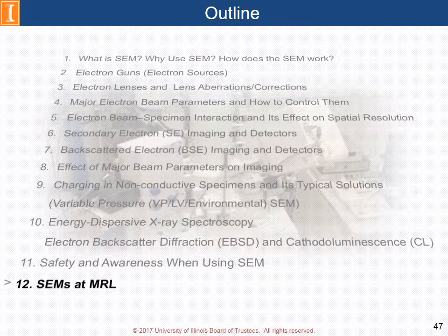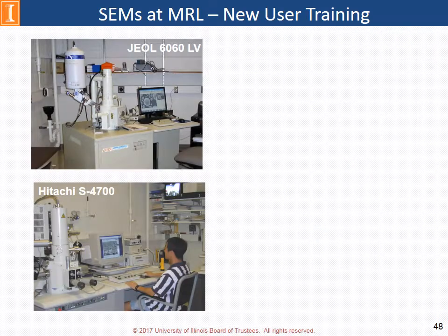Finally, we will briefly introduce the SEMs available at MRL. In this section, we will briefly introduce SEMs in MRL. JEOL 6060LV and Hitachi S4700 are the two SEMs open for new users.